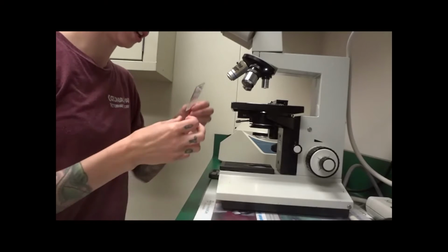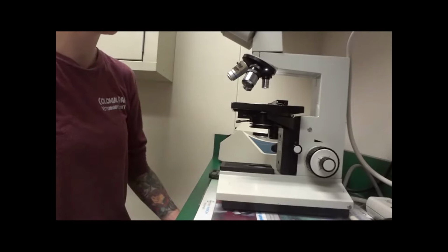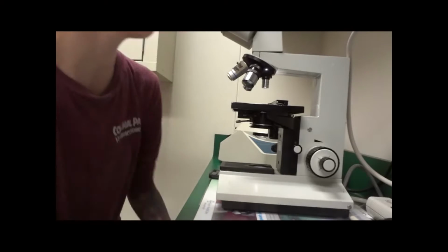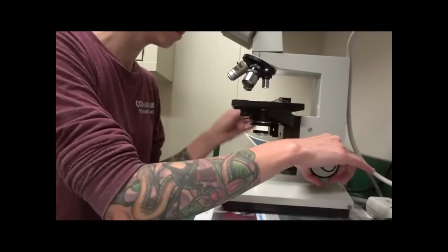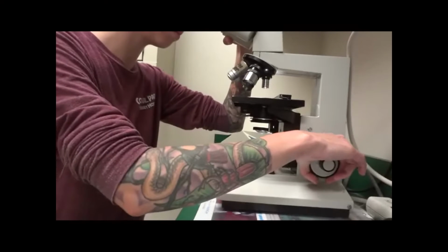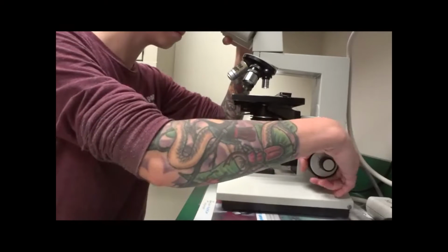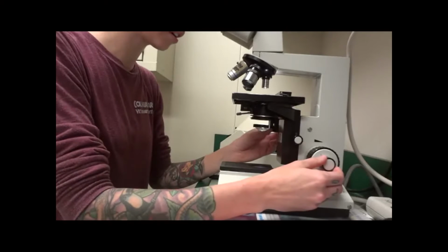We will now be viewing our vaginal cytology on the microscope at a 400 power. Zooming in with our coarse knob. And then fine focus.